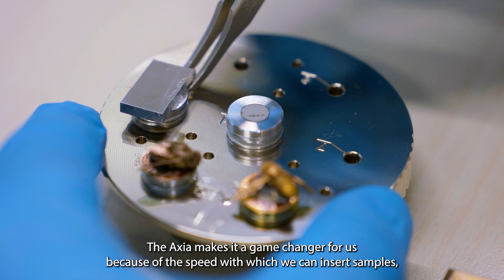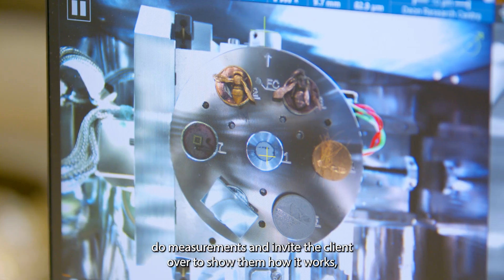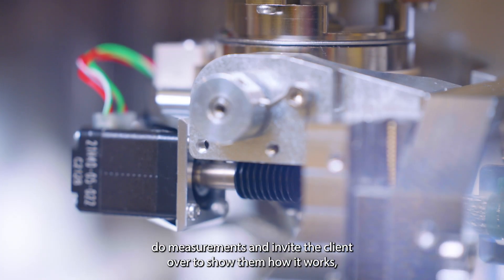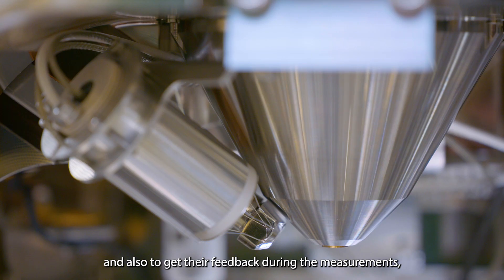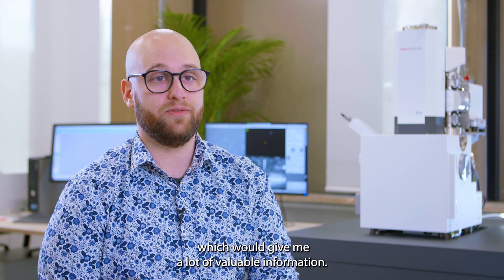The Axia makes it a game-changer for us because of the speed with which we can insert samples, do measurements, and invite the client over to show them how it works and also to get their feedback during the measurements, which gives me a lot of valuable information.